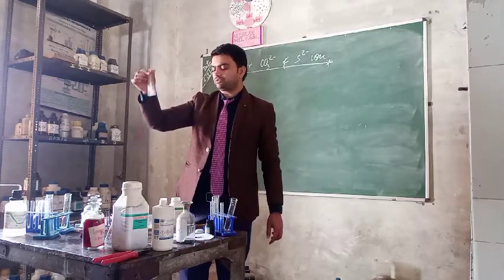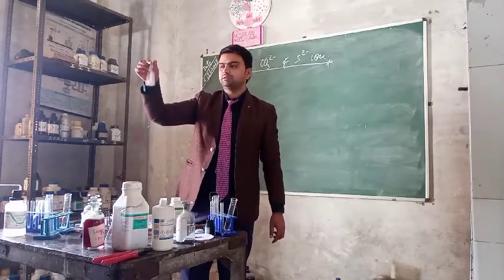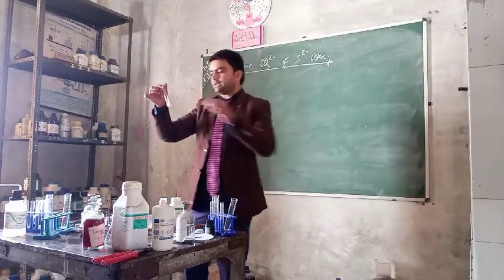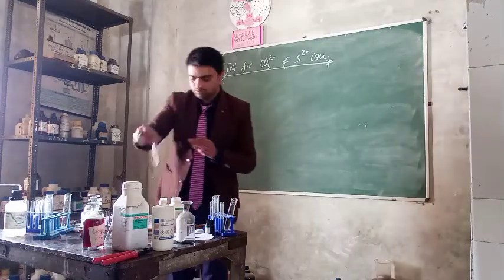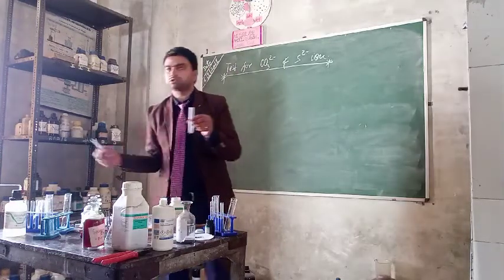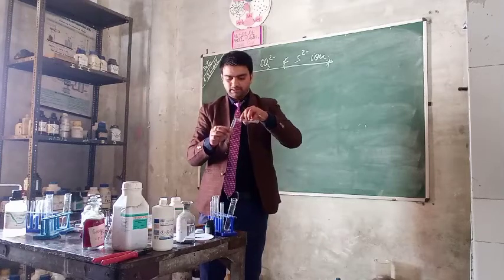This is the aqueous solution of the salt. The heat is necessary for the dissolution because the temperature becomes low in this situation. So first I will take some amount of the aqueous solution of the salt into another test tube for the next confirmatory test.